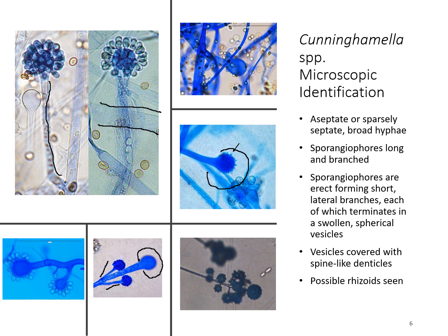So that is where those sporangiola actually connect to. You can see a lot of those on these images where they're still attached. But then you have those little prickly things coming off of it. And if you look real close at this image, you can see some of those there as well. So this is kind of the classic look of the Cunninghamella, and it differs a lot from the species that we're going to look at coming up.